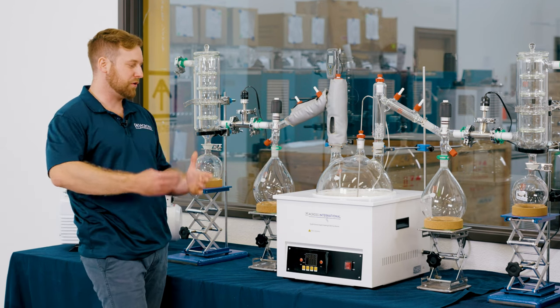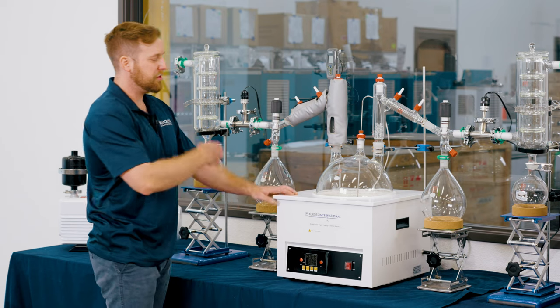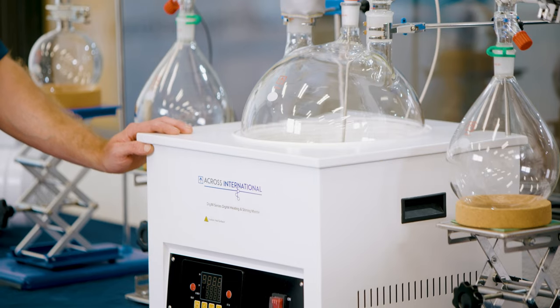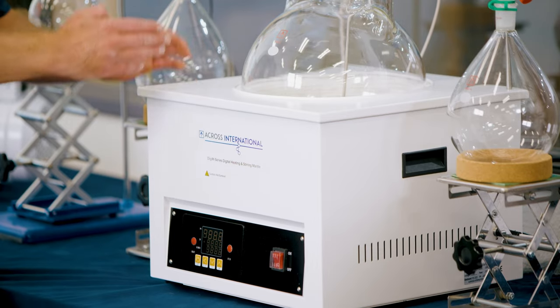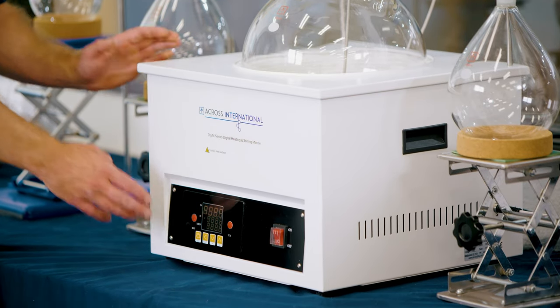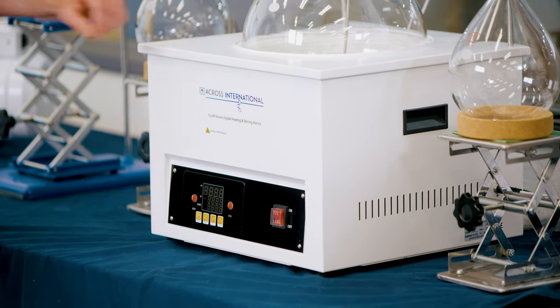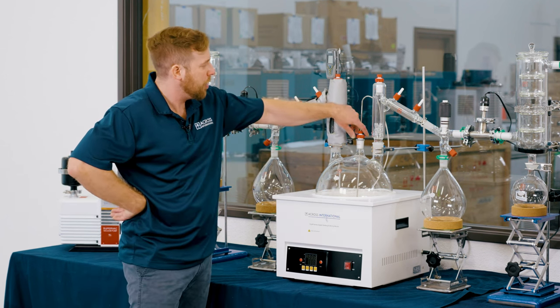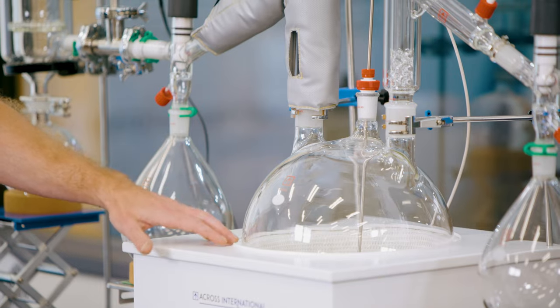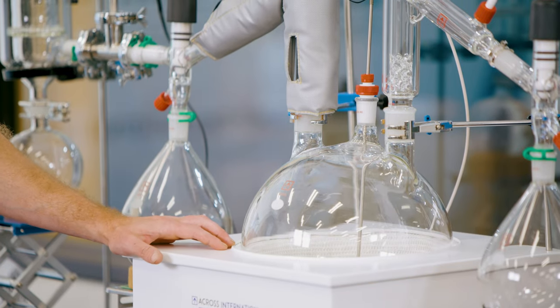So the first thing that we're going to notice is our mantle. This is where heating and stirring are controlled. Unlike a lot of other mantles out there, ours has the stirring as well as the heating included into one system. Not only that, but you have the ability to either run process temperature or temperature off of the mantle, giving you much more versatility.